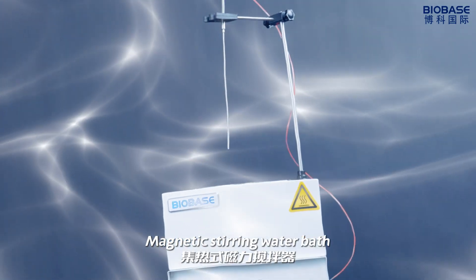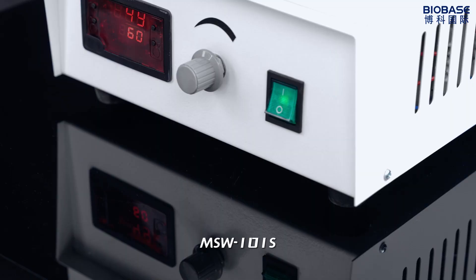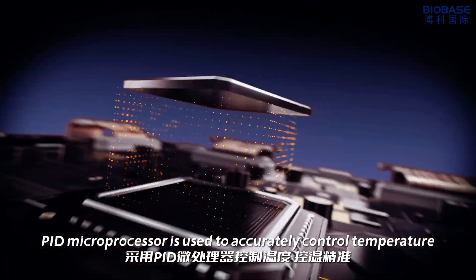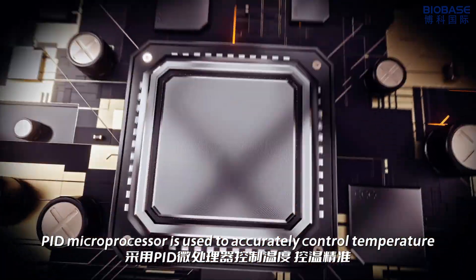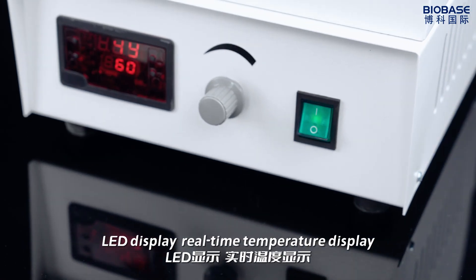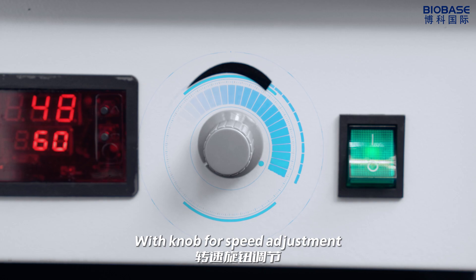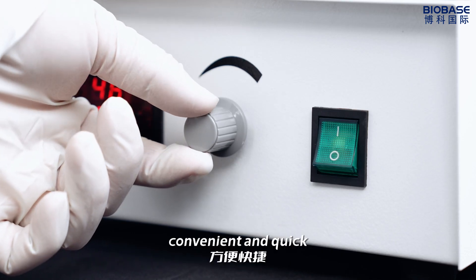Magnetic Stirring Water Bath MSW101S. A PID microprocessor is used to accurately control temperature. LED display provides real-time temperature display. There is ample room for speed adjustment, convenient and quick.